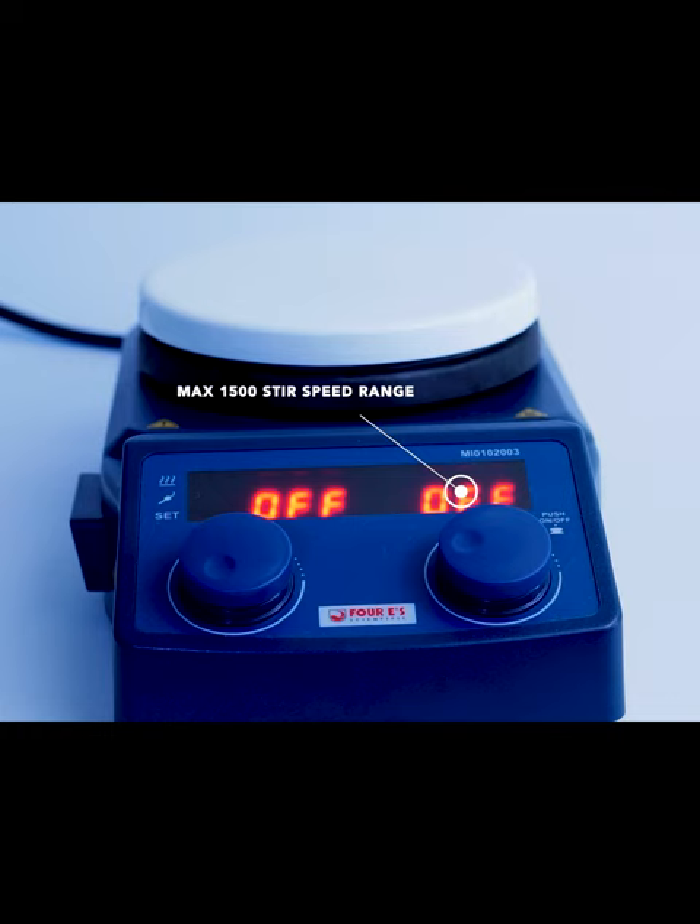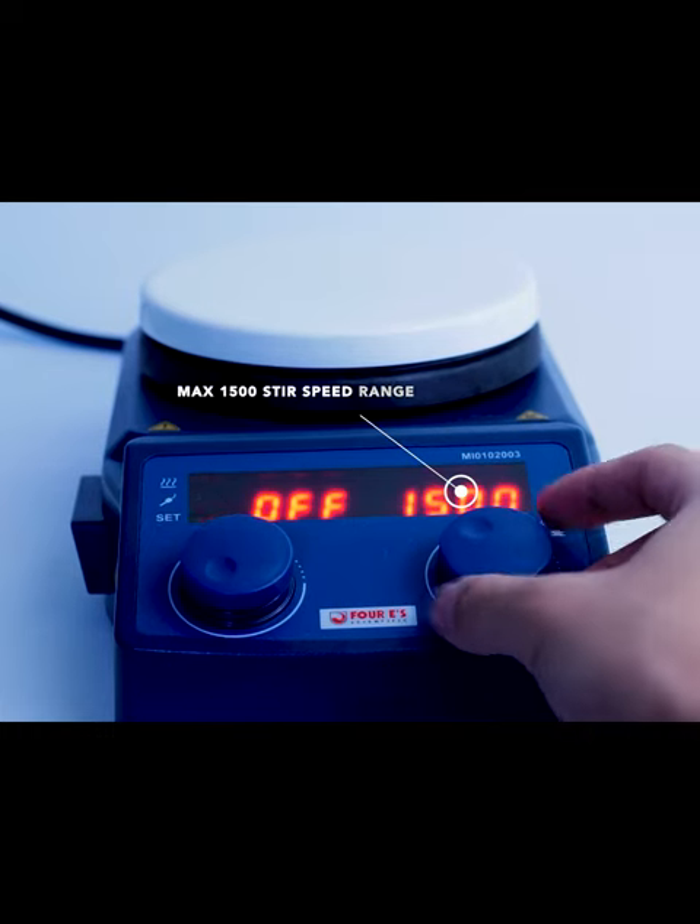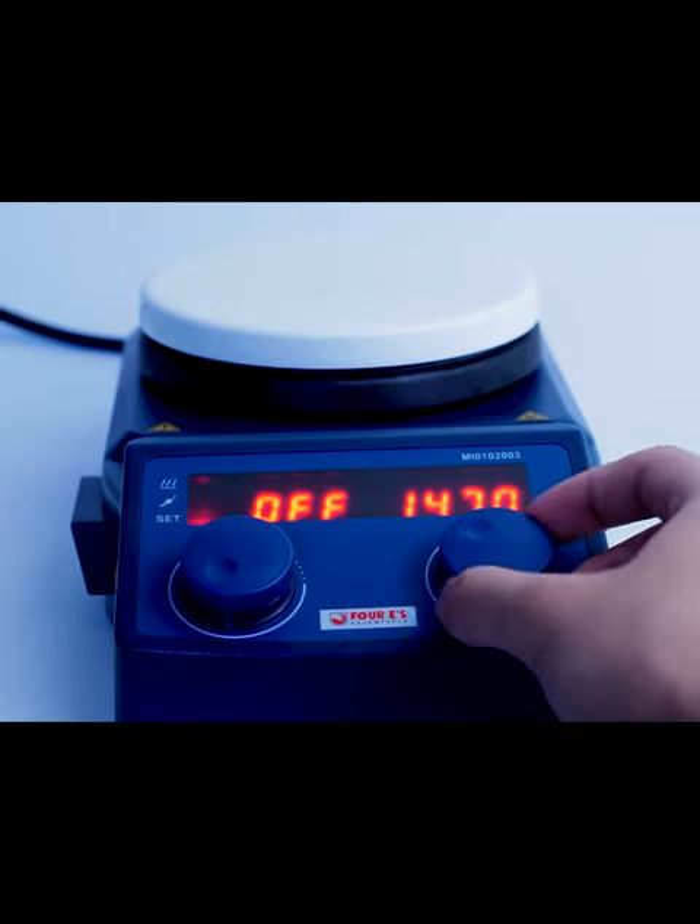The right-hand side controls the stir speed and has a max of 1500 RPM.